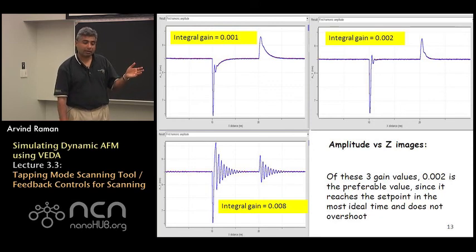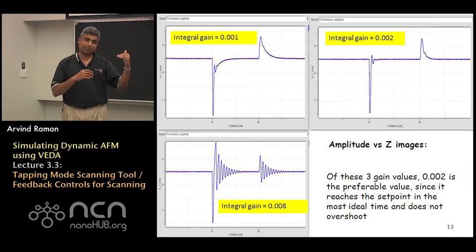And here again we have displayed all the different error signals as a function of the different integral gains. And what you find is the error signal again is basically the amplitude of oscillation. You find that at very low gains, once you hit the edge of this object.